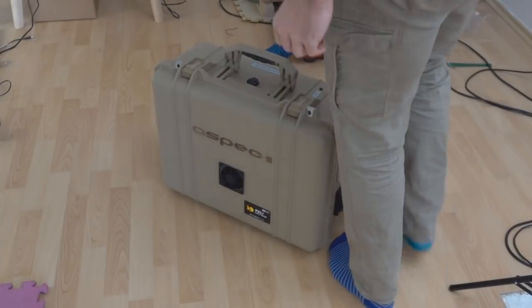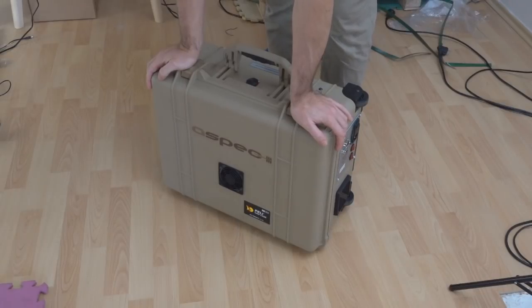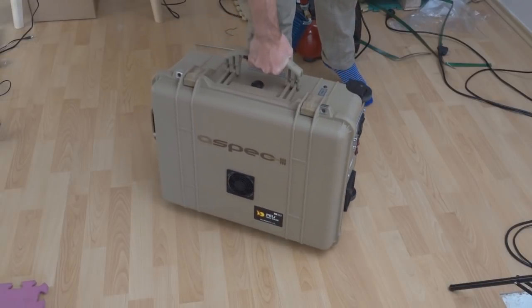So this little box here cost me about $20,000. It's fairly portable, so you can move it around.